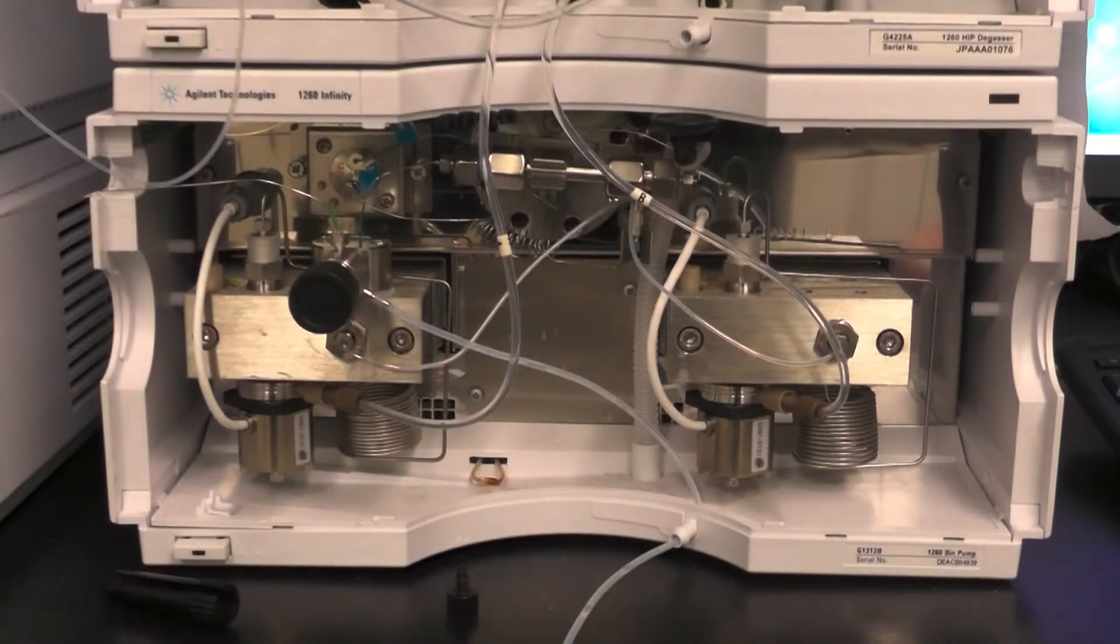The vacuum degasser removes visible air bubbles from the pumping system so that they do not affect the samples.